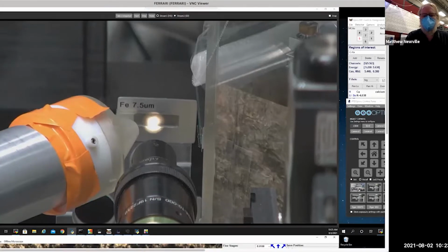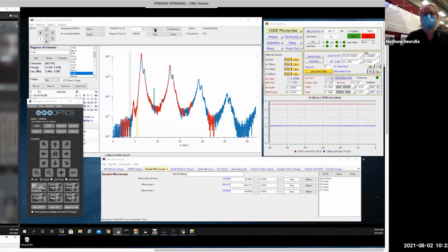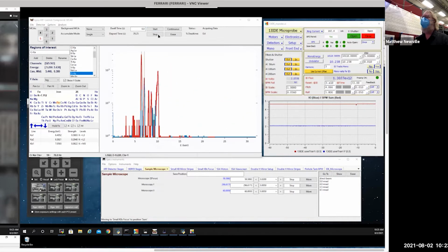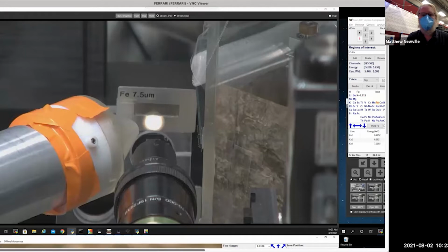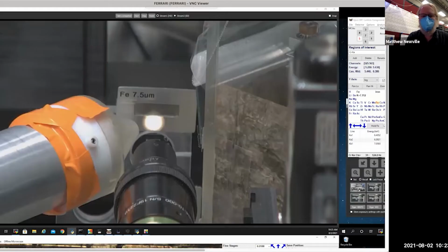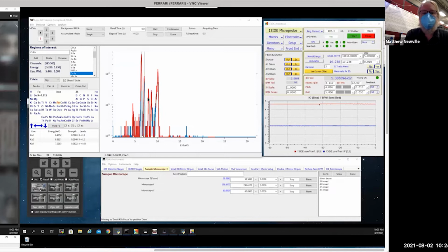And if I go over here to the next panel over to the right, that's the fluorescence spectra that we see. Now, we're well above the iron edge, and it's pure iron. So we're seeing lots and lots of iron. Here you can select the K alpha, K beta lines for the iron. But if I go just a little bit down from this to what is actually the aluminum frame of that sample, let me show you here. I'm now on the aluminum frame. Go down and show you what that looks like zoomed in. That's the microscopic image of the aluminum frame. We're on the aluminum frame. And this is the fluorescence spectrum from the aluminum frame.